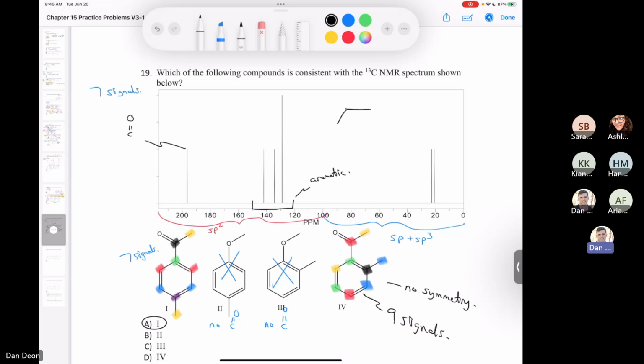So let's put this compound like this. So we're just redrawing the compound. So this would be para-methylacetophenone is what you would call this compound. It's kind of at a weird angle. Maybe that's a little better. Something like that. And there we go. All right, so now we're going to label the peaks A, B, C, D, E, F, G.